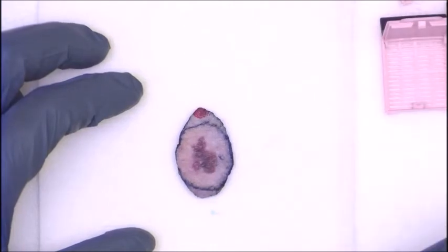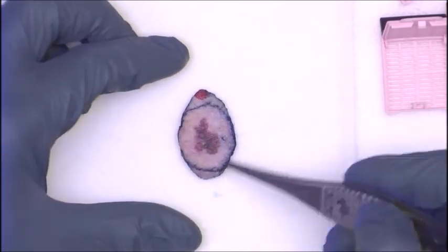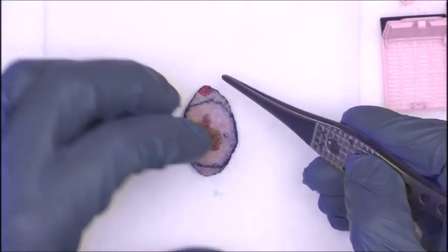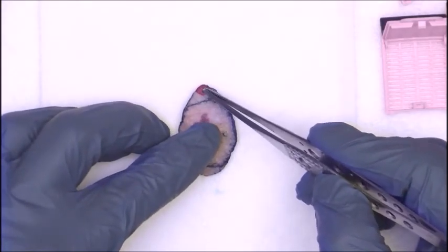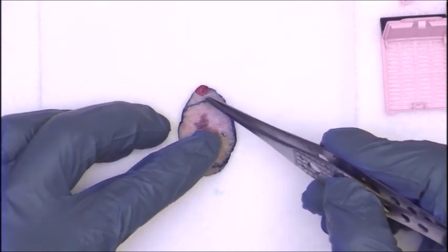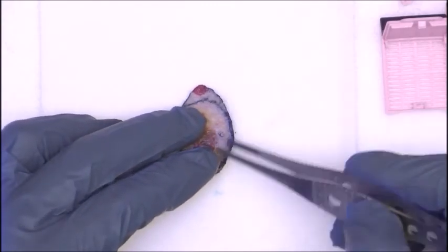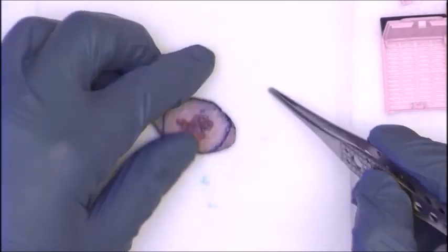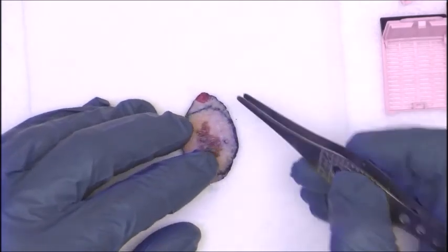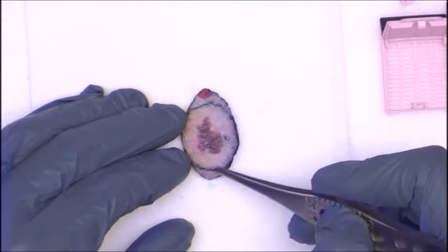So the last thing I was doing, I was inking the ellipse. As you should recall, I inked the 12 to 6 o'clock side green, the 6 to 12 o'clock side blue. And then I went ahead and put a little bit of red ink over the 12 o'clock tip. You may or may not want to do this, but especially if you're a beginning PA, you may want to do it, because sometimes I've seen in the past the sutures are taken off and then the specimen is knocked around or moved around, and then someone doesn't remember which was the 12 o'clock tip. So anyways, I'll put a little bit of red ink on the 12 o'clock tip. Once again, 12 to 6 green, 6 to 12 blue.